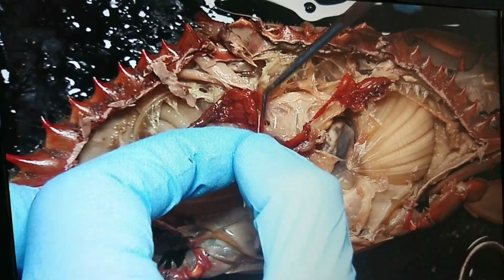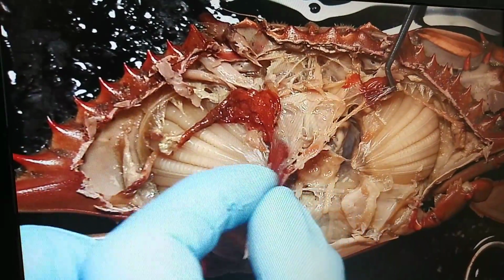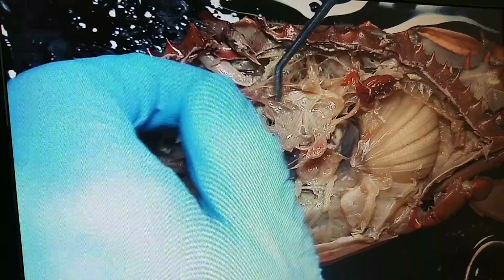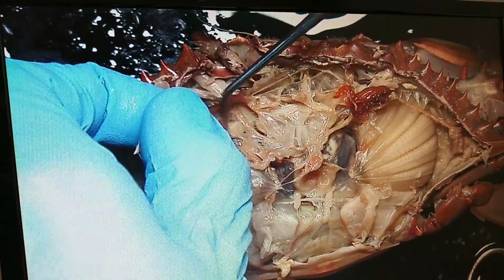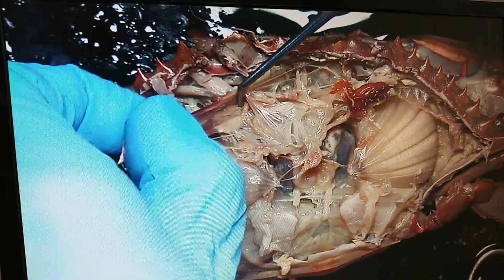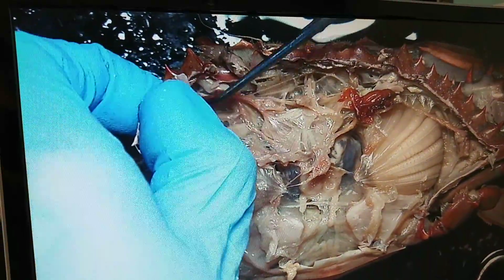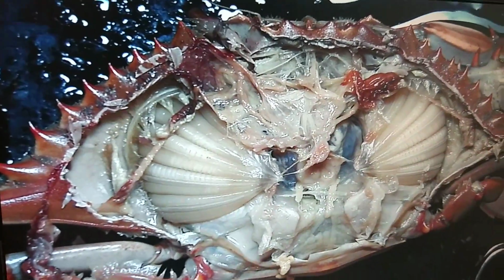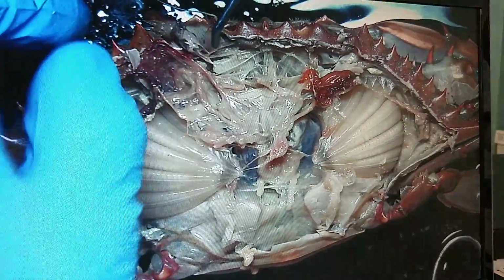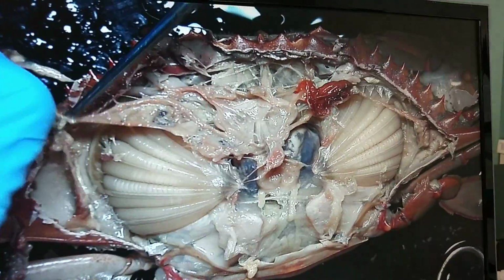So what are you picking at? Sorry, this is probably just part of the shell, a little bit of shell. There's a little bit of ovary on here. There's a little bit of digestive gland on here. So is the ovary what you're taking off? I mean, there are chunks of it on here, so probably yes, part of it is coming off. This is probably all part of the hypodermis that's coming off. But with that, unfortunately, I am taking ovary and digestive gland.